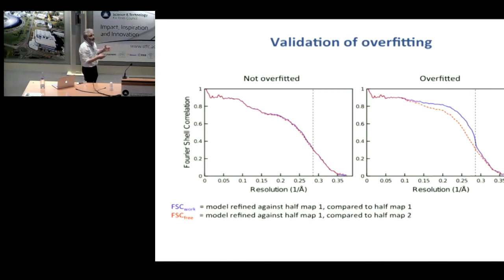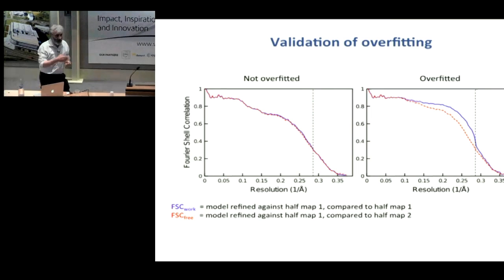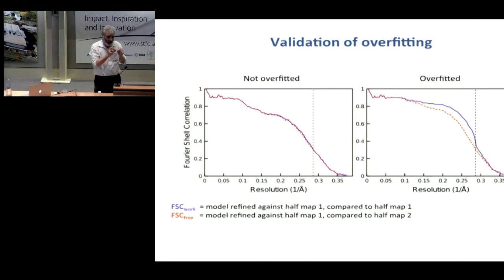That will give you a degree of overfitting. If your model is in the map, then the only way you can have overfitting is by increasing the number of parameters, or changing the way you restrain your parameters. I'm sorry that I didn't answer your question directly, but at the moment it is an open question.